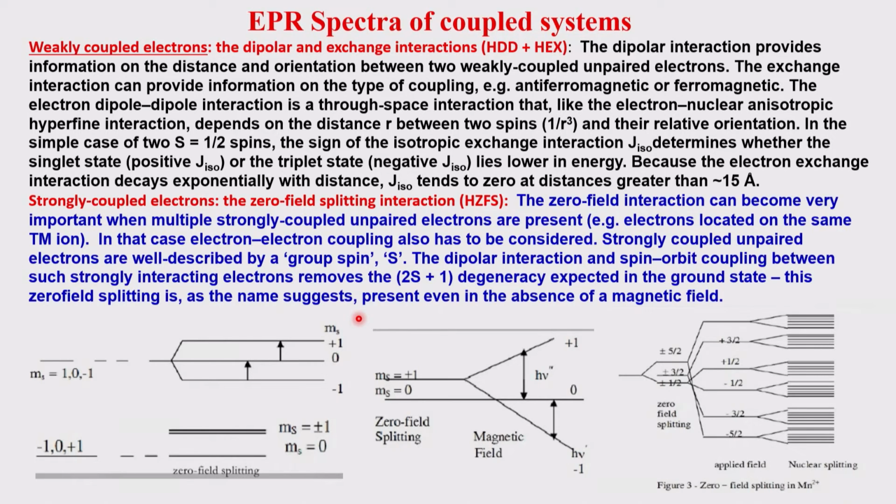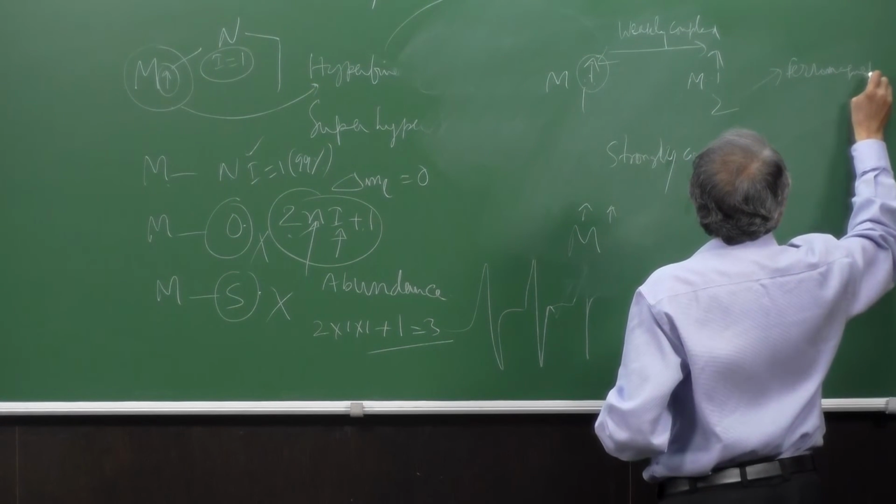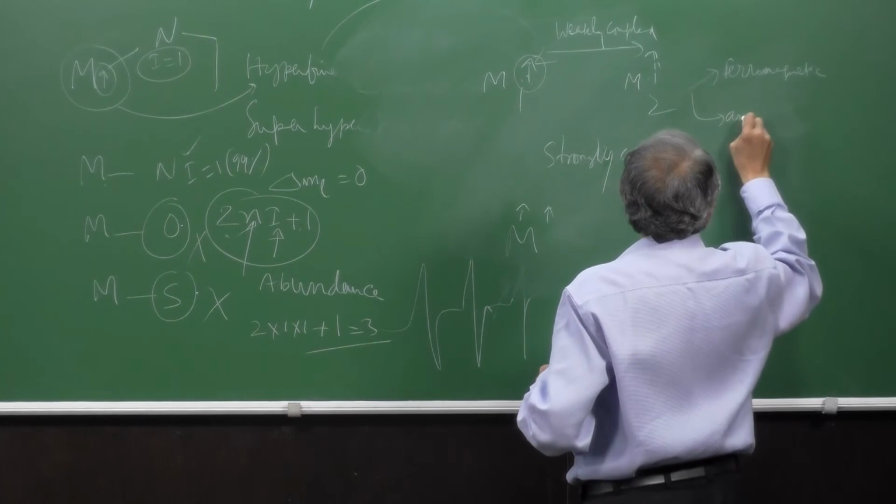These are called dipolar interactions, which are distance oriented. Such an exchange, if the moments add up, will become a ferromagnetic interaction of the two electrons' magnetic vectors, or antiferromagnetic.